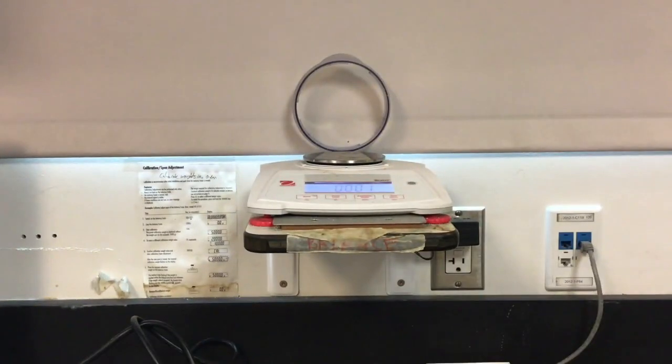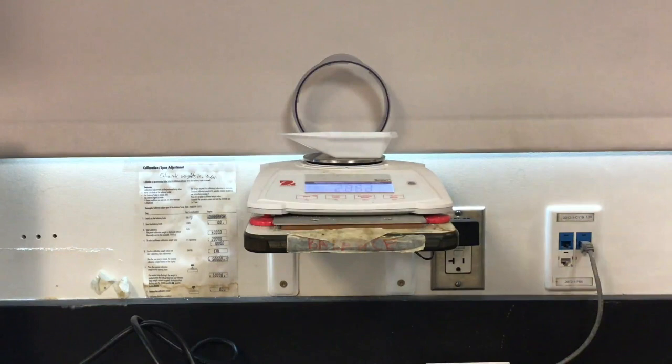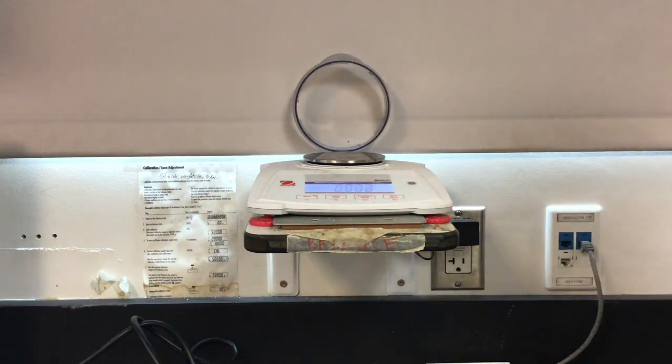For part B, we're going to make an aqueous solution of copper sulfate pentahydrate. We're going to start by weighing our empty weighing boat, and then you're going to weigh between 2 to 3 grams of copper sulfate pentahydrate to that. So we have 2.8 grams.